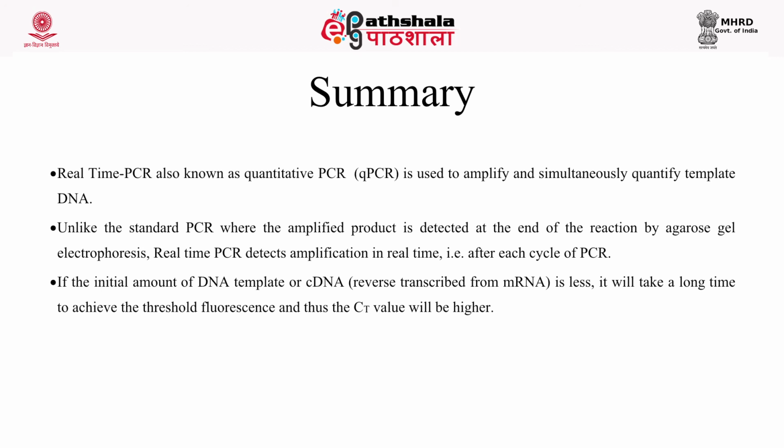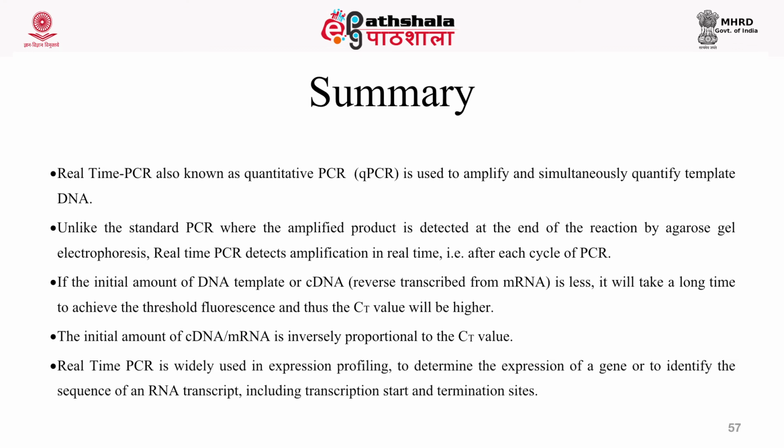The initial amount of cDNA or mRNA that is used is inversely proportional to the cycle number or CT value in real-time PCR. The real-time PCR is a widely used technology for gene expression profiling, and it has been very useful in molecular diagnosis, forensics, as well as in cancer biology and diagnostics.